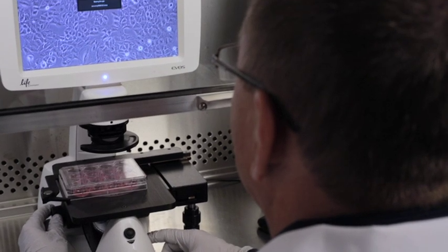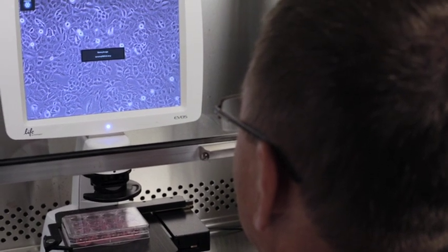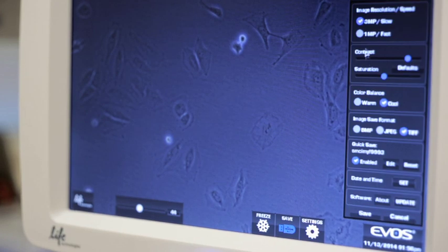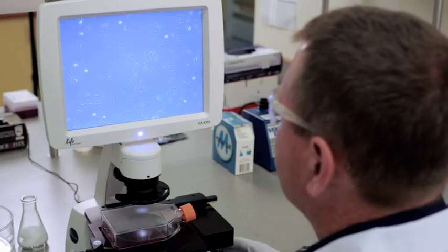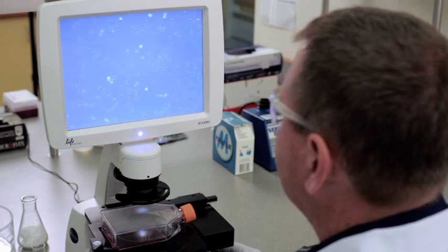Oculars have been replaced with a high-resolution LCD screen and the user interface and controls are simple to operate. The best part is that there is no alignment necessary and there are no bulbs to change, ever.